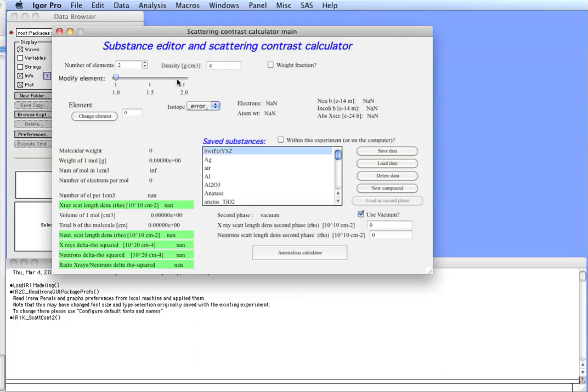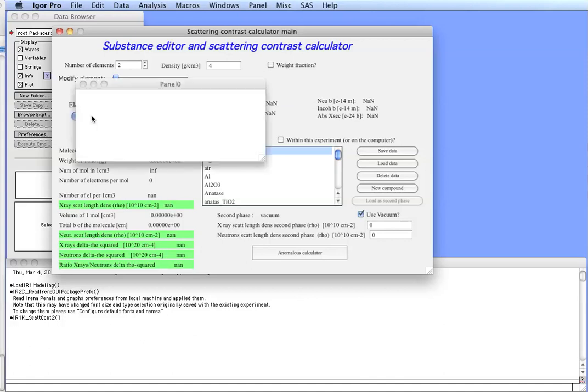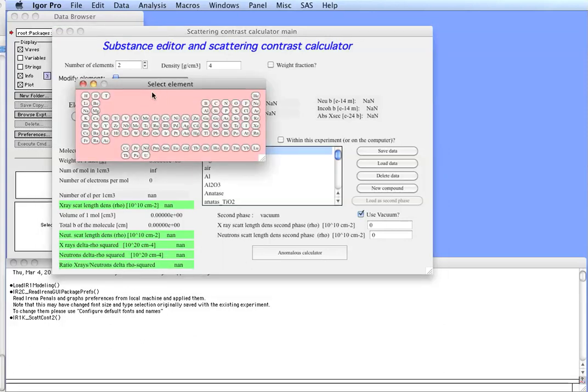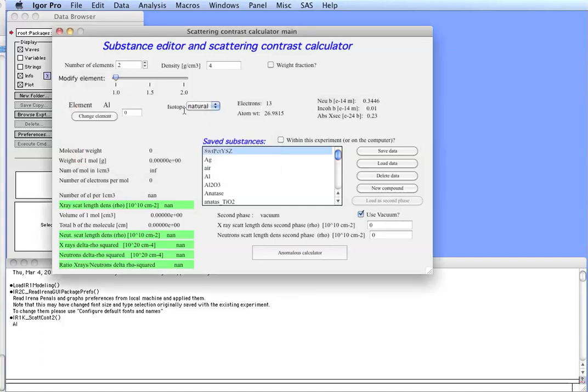Now, here the slider allows us access to the elements. So, this is element number one. This button pops up a periodic system. Al is the right button. So, now we have Al. In this case it's Al2.